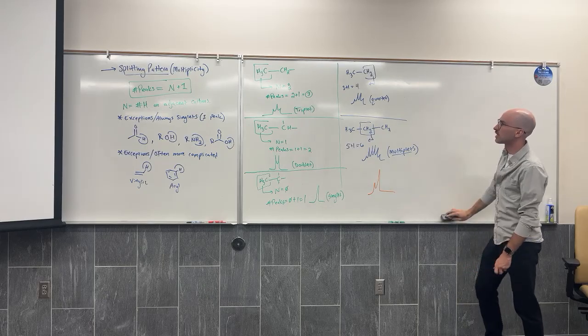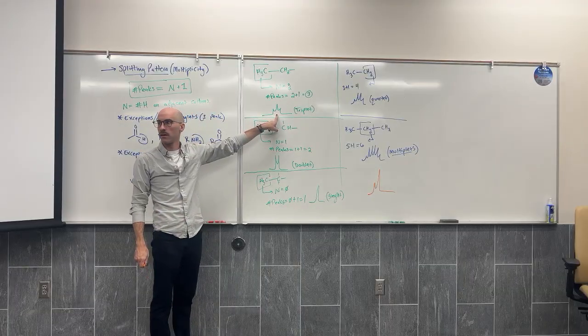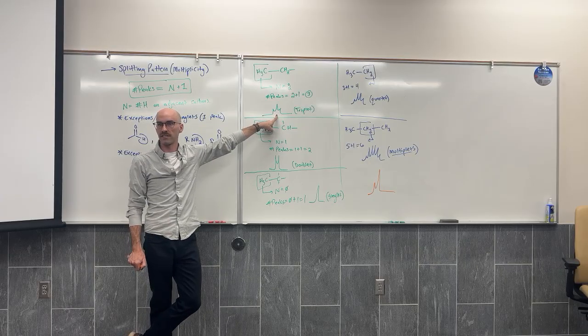Okay, can we verify real quick, what is the integration of this triplet? How many hydrogens are producing this signal?